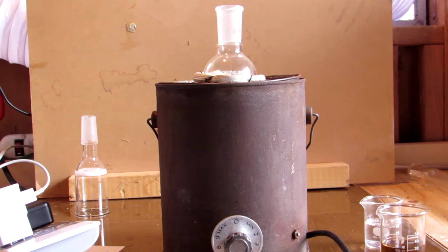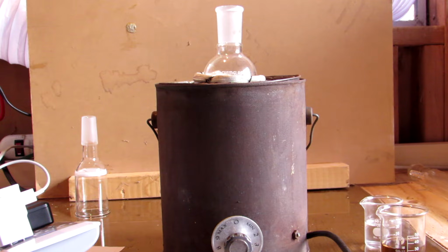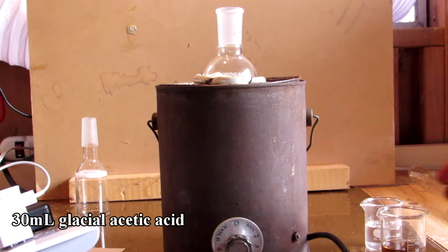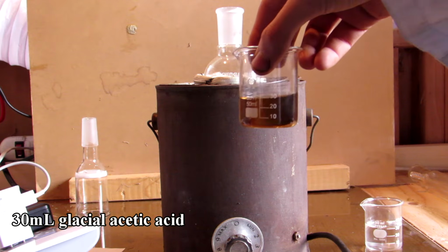Today we will be producing some ethyl acetate through the reaction of ethanol and glacial acetic acid. This is a Fischer Esterification reaction where a carboxylic acid is reacted with an alcohol in the presence of an acid catalyst. To begin, we can measure out 30 milliliters of glacial acetic acid, which I showed how to produce in a previous video.